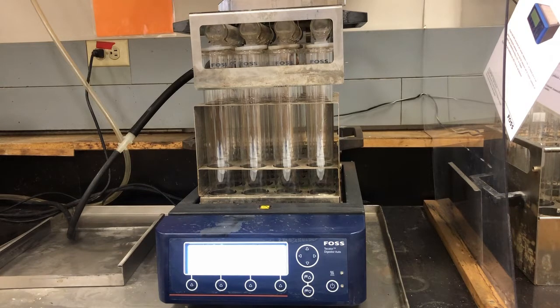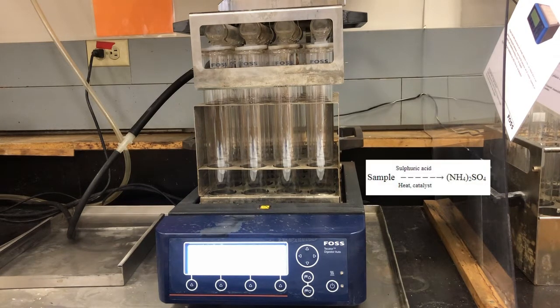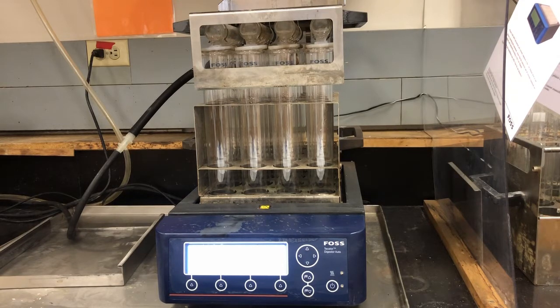This is the part of the process where the proteins or the nitrogen in the sample is broken down into ammonium sulfate. The protein in the presence of sulfuric acid under heat and with the catalyst produces ammonium sulfate. And when that's finished, we will go on to the next step, the neutralization and distillation. So we're going to let this heat up.